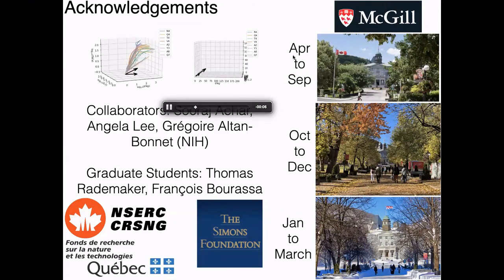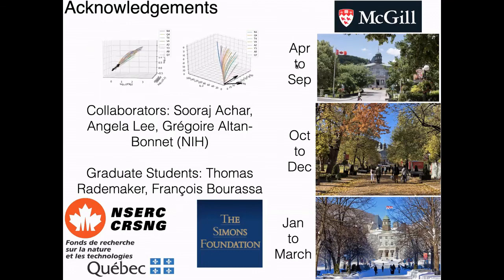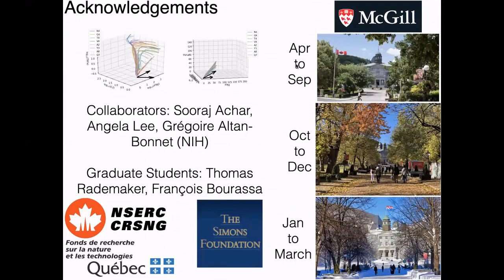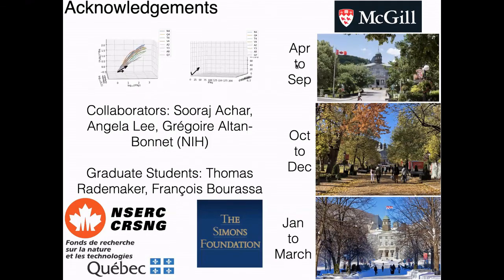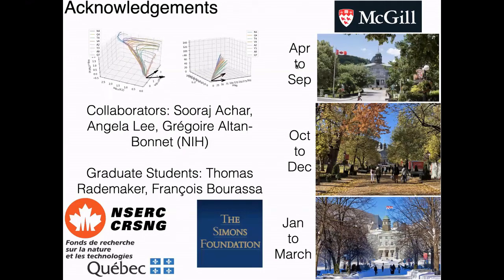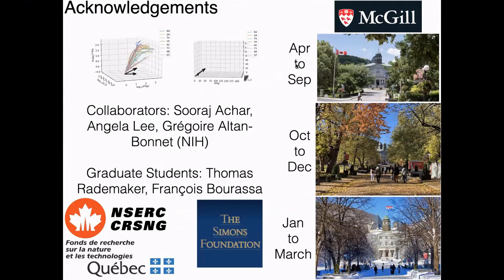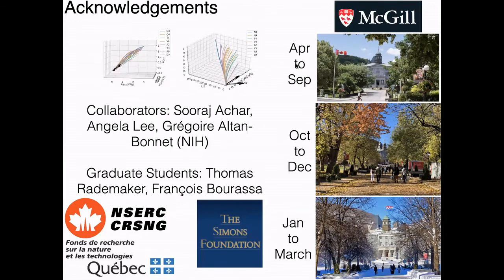Great, thank you. Perhaps we can squeeze in one more question here. It says, perhaps I missed it in your simulations, how was the effect of drug addition different for weak and strong ligands? Okay, the drug additions were not a simulation, they were actual experiments. We added different drugs to the cell and then saw how the response changed.